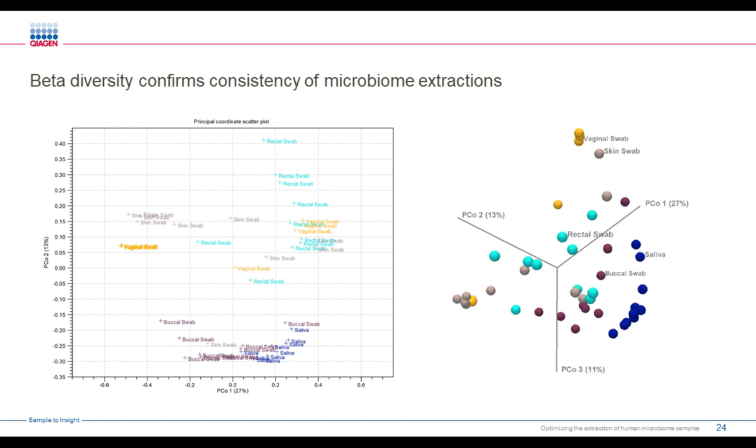But on the two-dimensional plot, I think you can see quite neatly that the buccal swabs and saliva samples all cluster together, that they have a similar oral microbiome type, but there are distinct differences that one can see. Buccal swabs are more like buccal swabs and saliva is like saliva, regardless of who the individual came from.